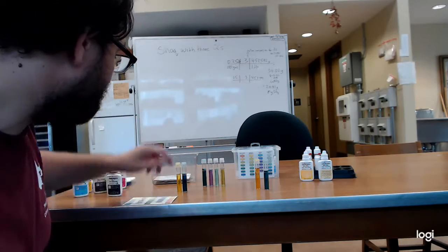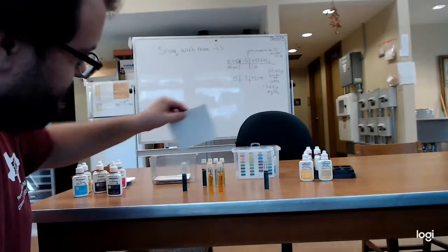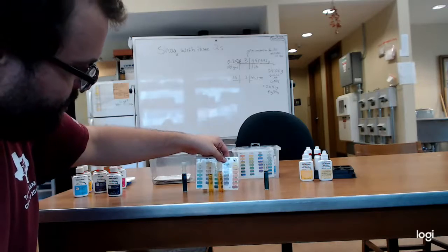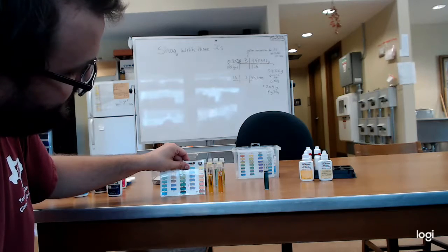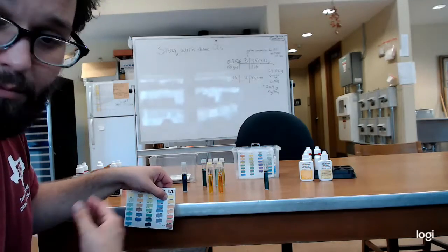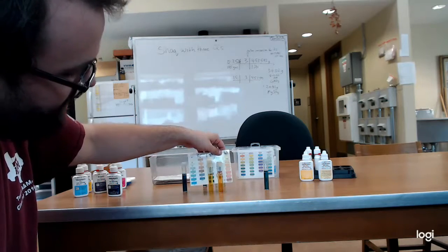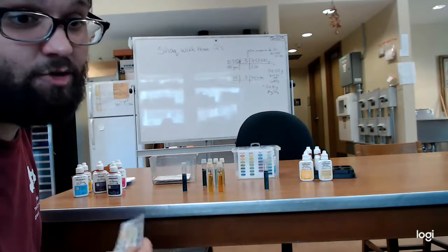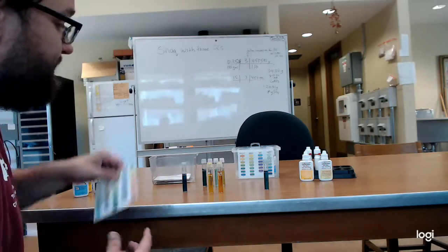And after that we went on to nitrate, the plant available form. This one's a little bit harder to tell the color differences, so I'll go ahead and put that card back behind so you can see that there is a slight difference. And over here we're getting about, I would say about 5 parts per million of nitrate in the nutrient fertilizer. So it hasn't been converted from the ammonia to the nitrate all the way there yet. Whereas in the compost tea, we're sitting at about 40 parts per million. And that's because the ammonia has been converted into nitrite, and that nitrite has been converted into nitrate, the final plant available form. And if we had some plants in here, they would be uptaking those.